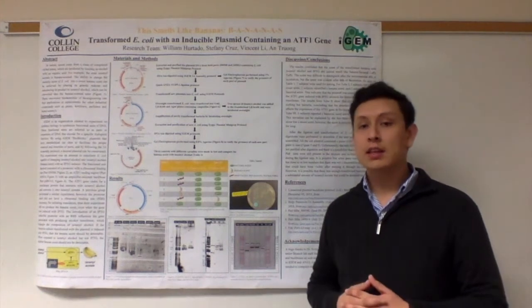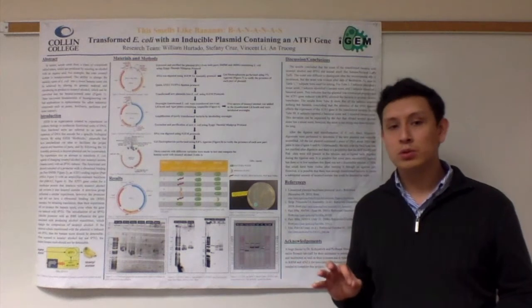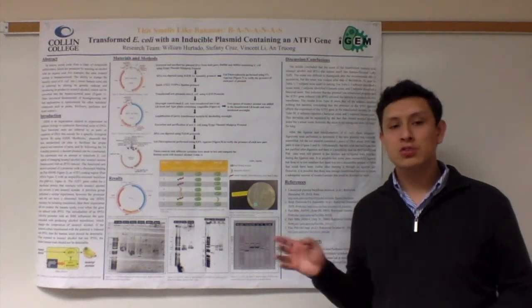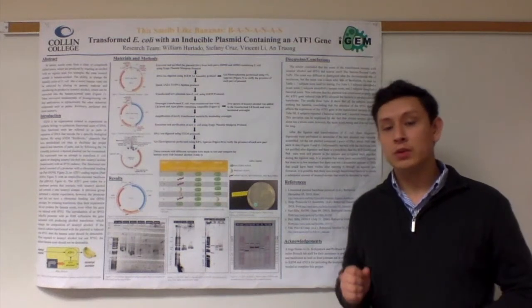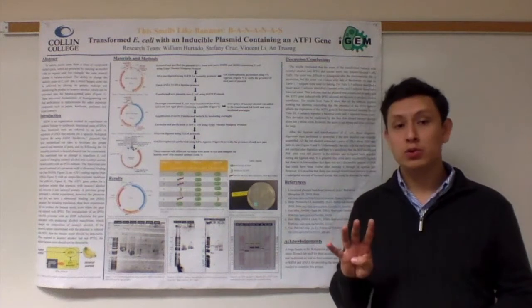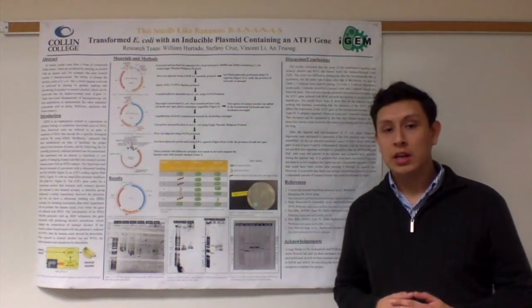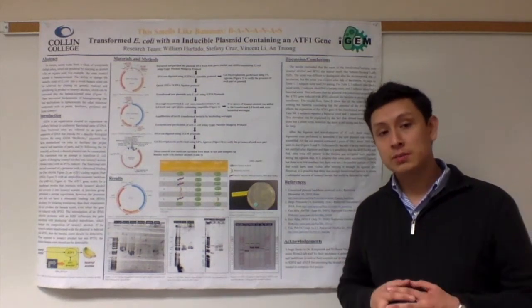We then conducted the sniffing test. The sniffing test consisted of having 7 subjects sniff our 3 tubes without knowing what's in the tubes, then answering a few questions and comparing the smells to a banana-flavored Laffy Taffy smell that we created by chopping up the Laffy Taffy and placing it in a 4th tube mixed with deionized water. In between tubes, we had the subjects sniff coffee beans in order to neutralize the smell.